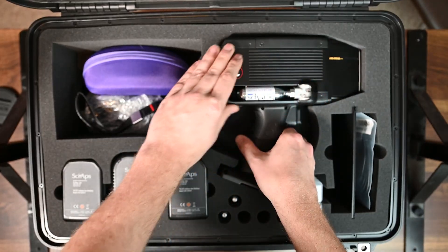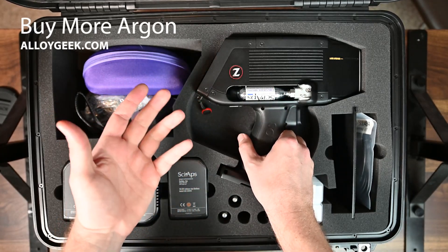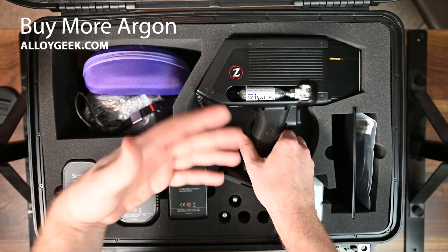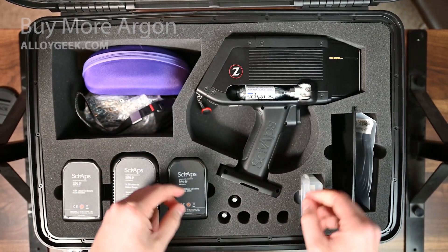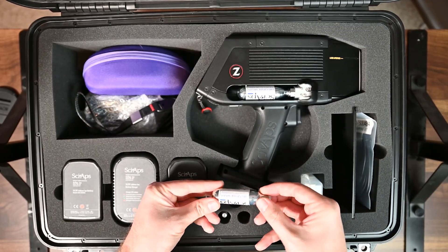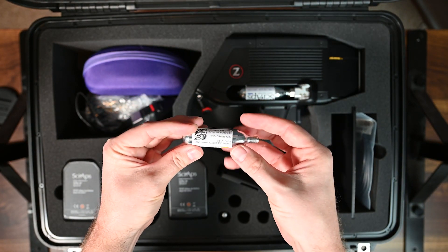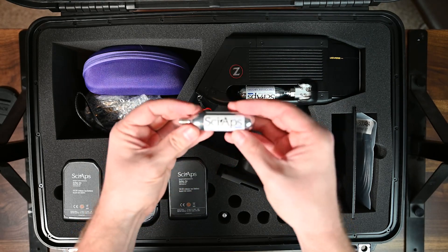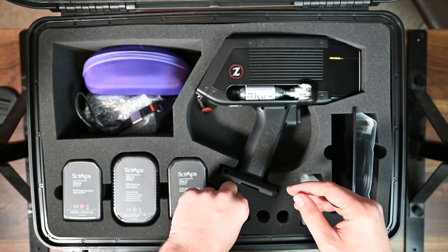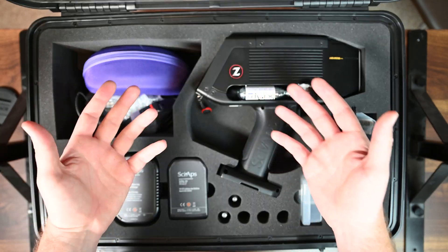When you look at this unit, the first thing you see is that nice design — you see the laser aperture up here — but you also see this argon bottle hanging off the side. It's actually a pretty small argon bottle, just big enough to provide about 200 readings for this analyzer. There are some spares that tuck nicely into the case, and they're about the size of an airsoft or CO2 cartridge, except it's laboratory-grade argon specifically meant for LIBS readings.